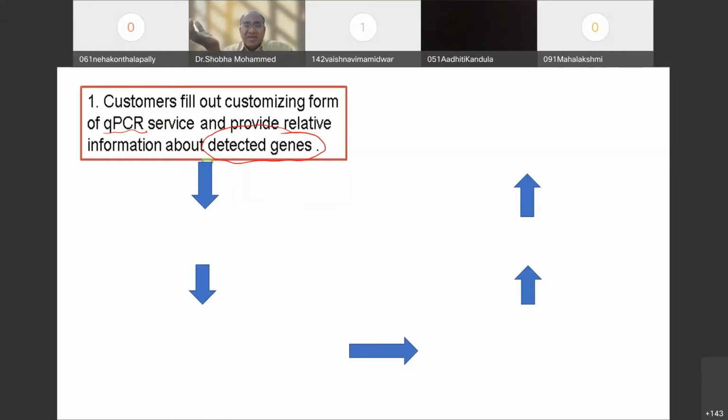They are pre-designed primers. So I throw those primers into the solution, then run the detection to see whether that particular fetus, who is going to be born after the 9 months, once the gestational duration is over, will suffer or not, so that I can take precautions, or I can take a line of treatment to avoid that particular type of genetic disease with which the fetus will be born. So the detected genes, whatever we want, we will write that. That's an important point we need to understand here.